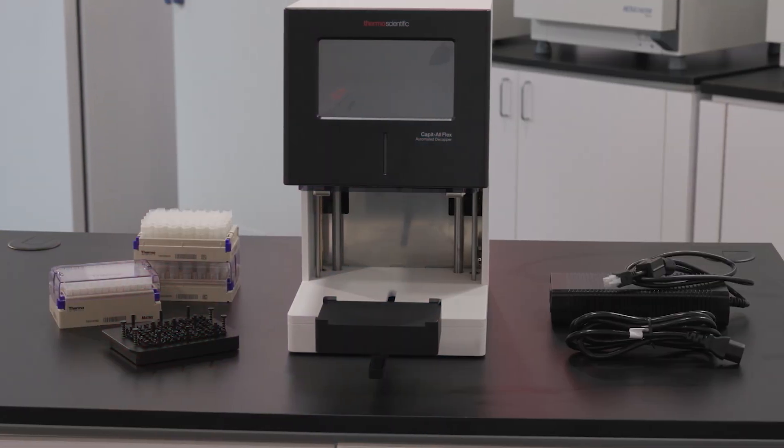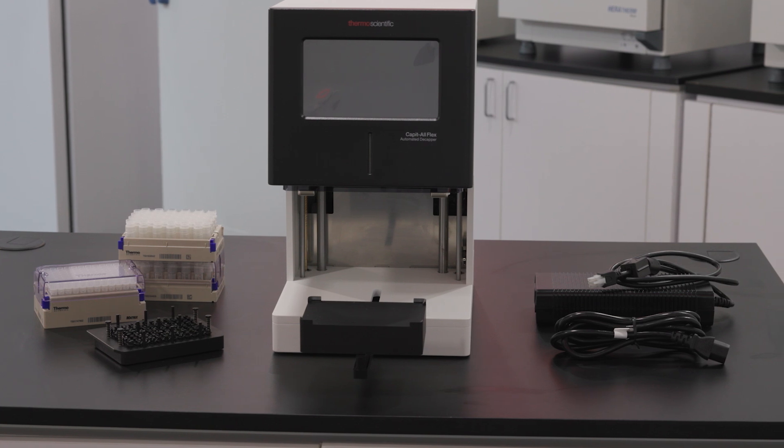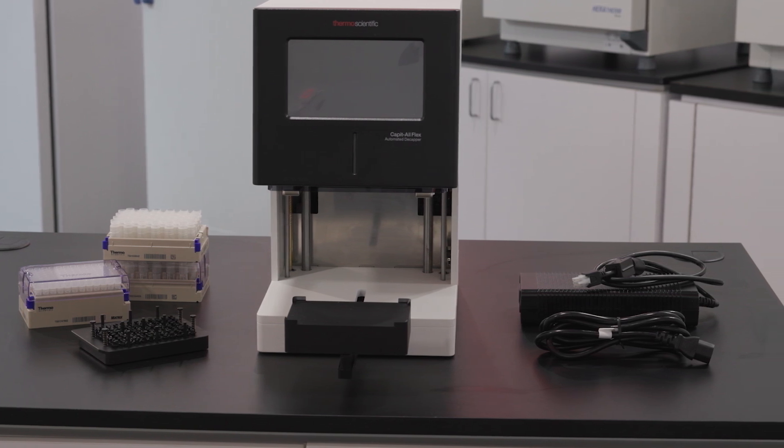Welcome! In this video, you'll learn how to operate your Thermo Scientific Kapital Flex automated Decapper.